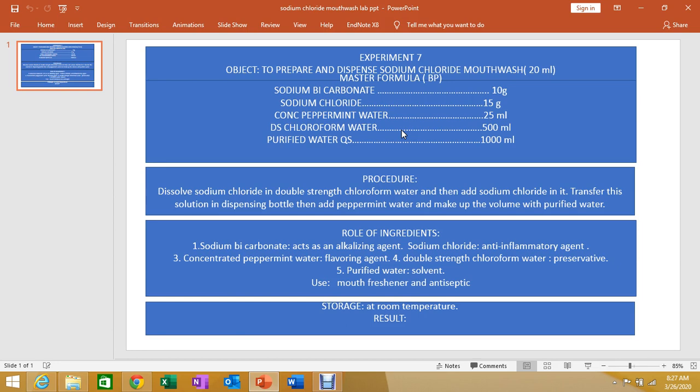We will calculate according to the required volume. To prepare sodium chloride mouthwash, dissolve the sodium bicarbonate in double strength chloroform water, then add sodium chloride. Transfer the mixture into a dispensing bottle and add peppermint water.